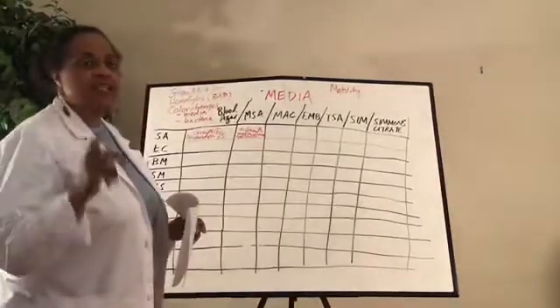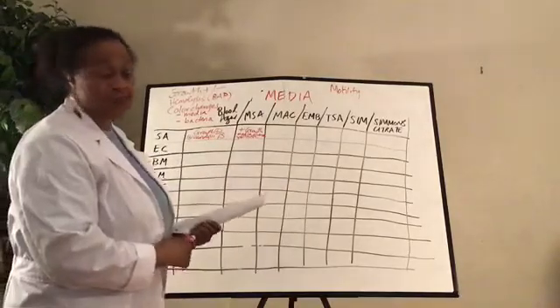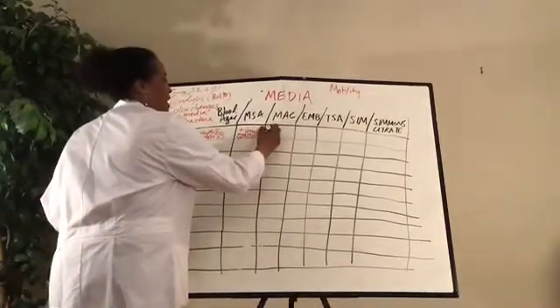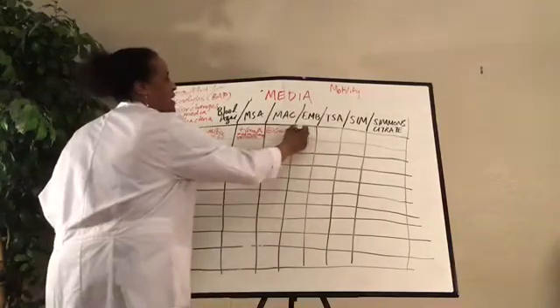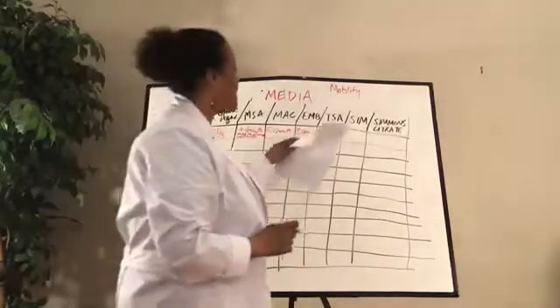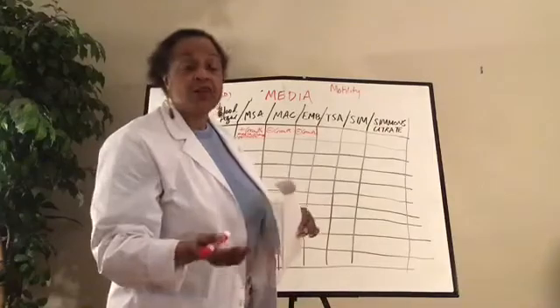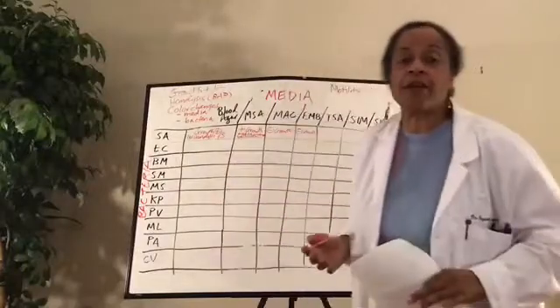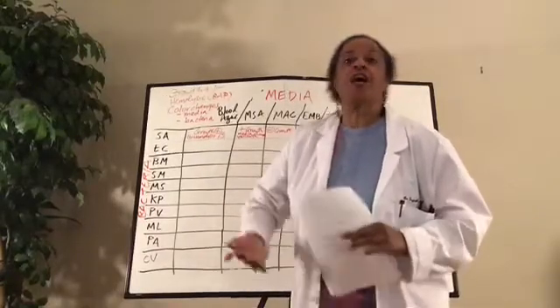So we're going to look at Staph aureus here as it goes with MAC. Does MAC like the Staph aureus? Would it prefer to grow on MAC? No. So it's going to be no growth, because MAC as well as EMB grow gram-negatives. Now EMB can also be used to identify lactose fermenters. Remember, they leave a greenish sheen, but all of these are enteric bacteria. Remember when we talked about Enterobacteriaceae? All these are things that come from the gut.